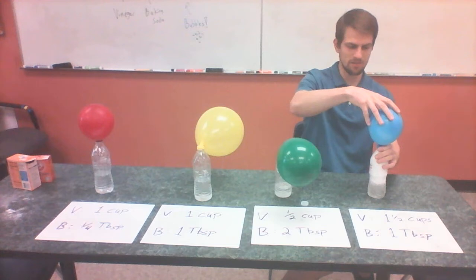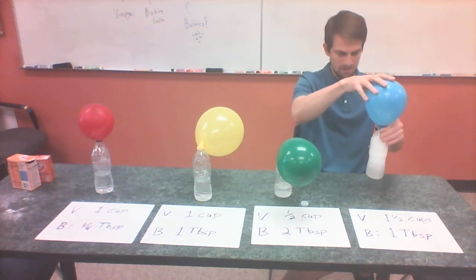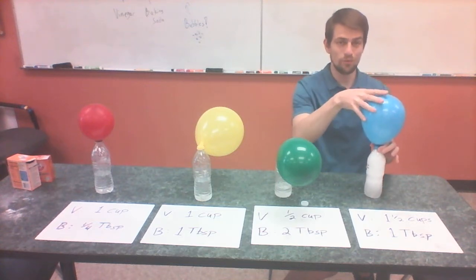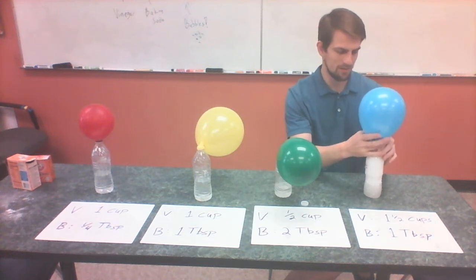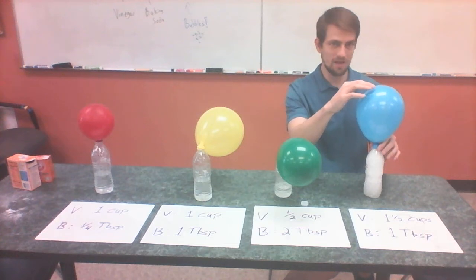Oh, once again, it is coming up into the balloon. Lots of bubbles, lots of chemical reactions taking place. I don't know if you can hear it at all through the video, but it's very fizzy as well. Lots of bubbles shaking everything around.